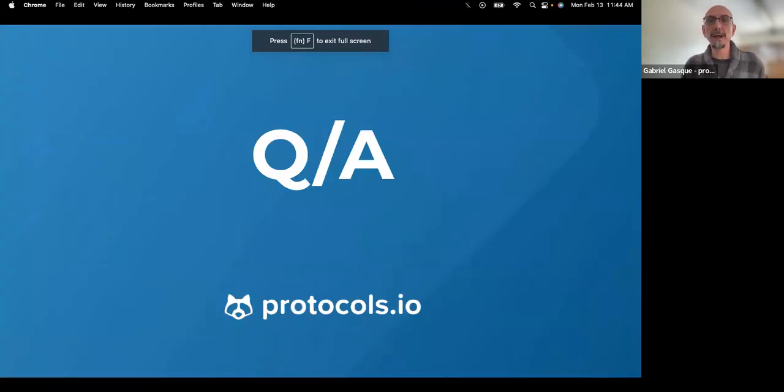So let's see if people have any questions. The question that Angie C is asking is whether for the free account there is a limit, which is 5 private protocols or 100 megabytes of space, whichever comes first, and that is correct. Yes.